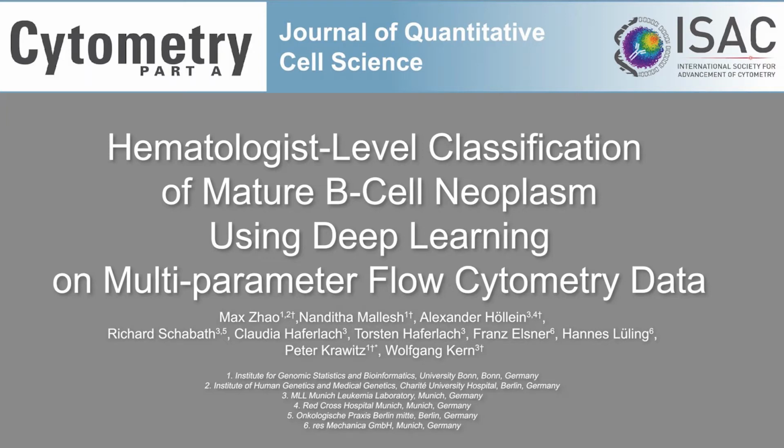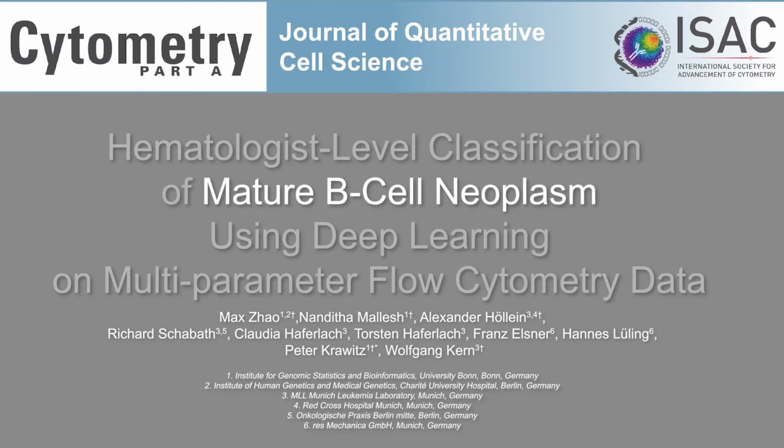Here we present our recent publication on automated classification of B-cell neoplasms using deep learning on multiparameter flow cytometry data. This work is published and is available online in Cytometry Part A.